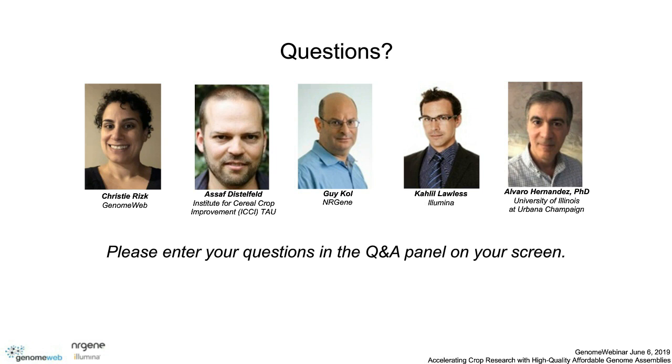Great, thank you. Alvaro, does the NovaSeq have a higher duplicate rate than the HiSeq 2500 and 4000? It does. But basically, it's always a balance between yield and duplicate rate. So what we have to do is find the sweet spot at which we have the highest yield and the lowest duplicate rate.